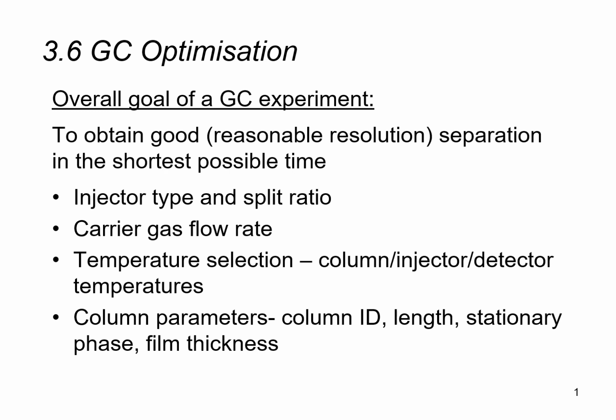In this next section, we will be considering the various parameters that bring about a good GC experiment. By good, I mean that we should have peaks that are well resolved, allowing us to identify and quantify, and also allowing us to perform the analysis in the shortest possible time. So a few of the criteria that we'll be thinking about is the split ratio for the injector, the carrier gas flow rate, and this third one we'll really focus on, that would be the temperature selection.